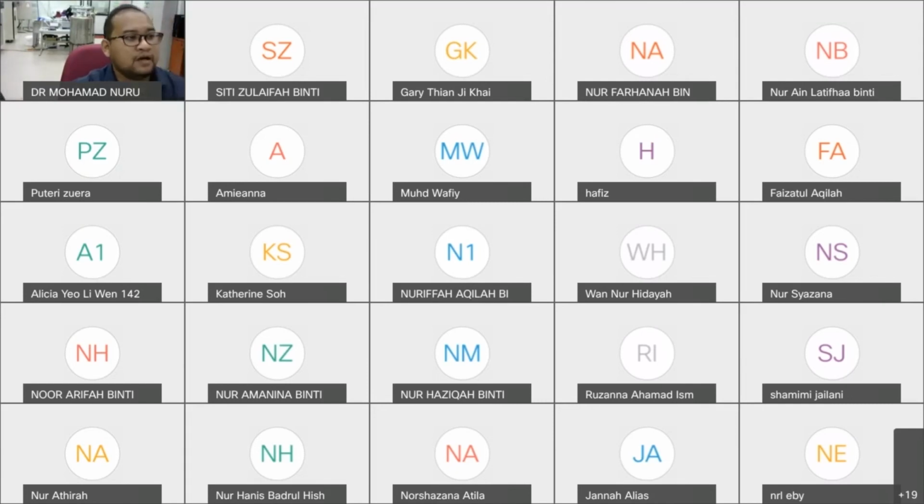Okay, for NMR, we have two types of slot. Day slot, okay, weekend slot, okay. Day slot for the short experiments, for example, for measuring proton, or any experiment that you want, it's less than 2 hours, we can run on that day, okay. For the long time experiments, for example, like Dr. Rizal's students, they need 24 hours, okay.